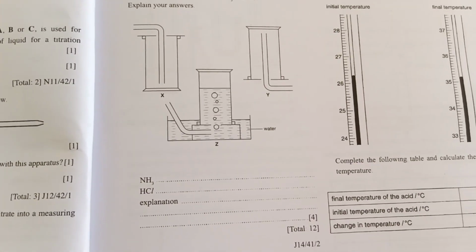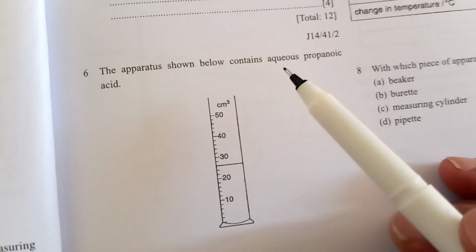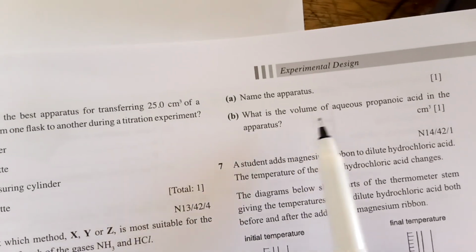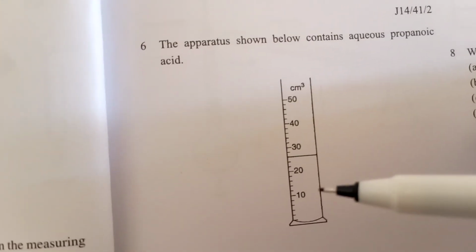Let me verify this. Now the apparatus shown below contains aqueous propanoic acid. The question is, name the apparatus. What is the volume used? The apparatus is a measuring cylinder.